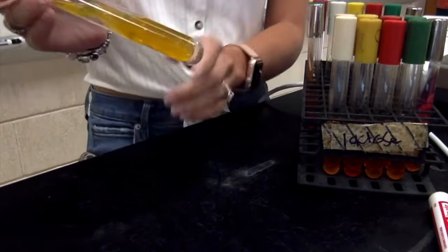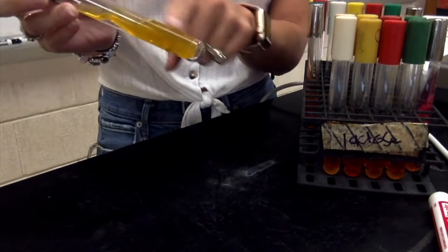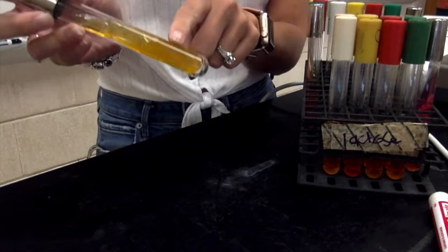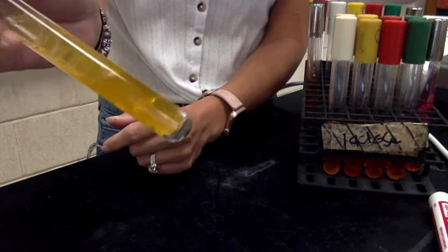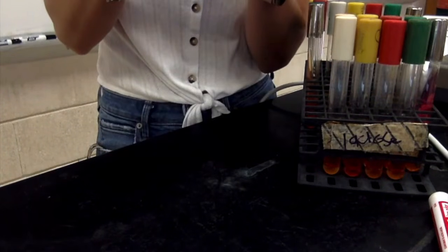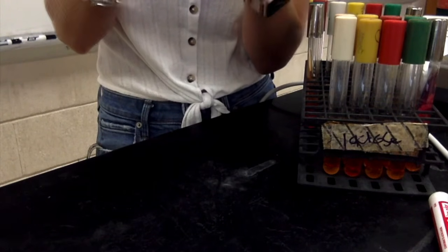Now, normally Citrobacter freundii would give you black colonies, and if I let it go a little longer, it might give us a black test tube, but it's not today. Normally you would get black H2S production for Citrobacter freundii. You can see there's a little bit of black starting to form inside of the tube, but it's going to be kind of hard for y'all to see.